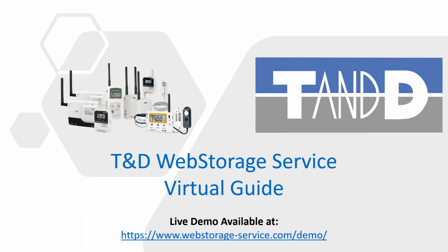Before we begin, I'd like to start with a brief overview of what this completely free offering from T&D is all about. T&D WebStorage Service is a cloud storage platform where you can view all of the information from the data loggers you have in use, wherever they are, locally in your facility or around the world. T&D provides a wide variety of data loggers used in the sensing and tracking of temperature, humidity, illuminance, UV, and more. And this platform provides the easiest and most accessible way to monitor, download, and share this critical environmental data.